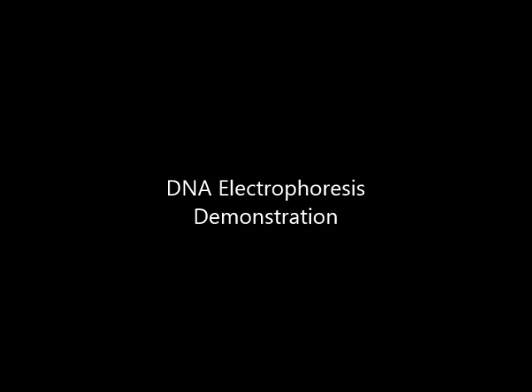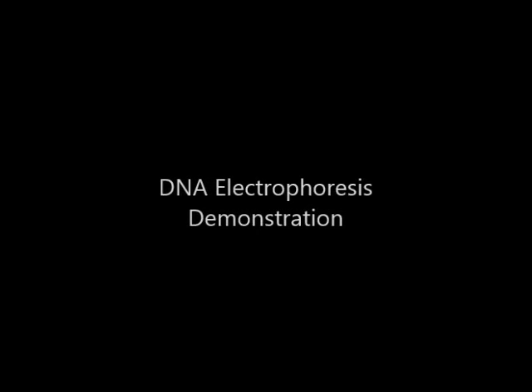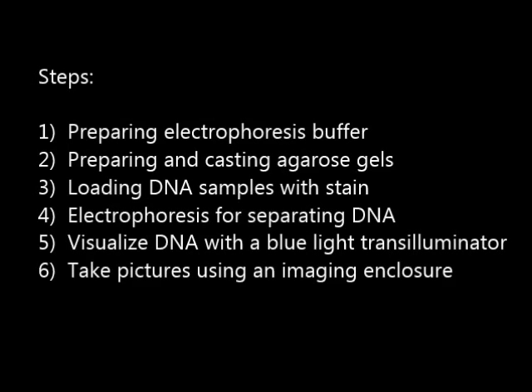In this video, we're going to demonstrate the basic process of DNA electrophoresis. Steps will include preparing electrophoresis buffer, preparing and casting agarose gels, loading the DNA samples with a fluorescent stain, using electrophoresis for separating the DNA, using a blue light transilluminator for visualizing the DNA in the gel, and finally taking pictures using an imaging enclosure.